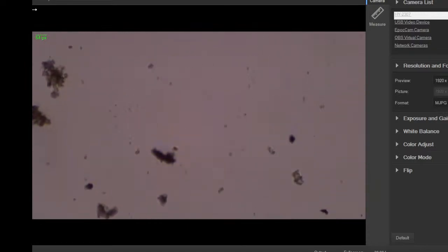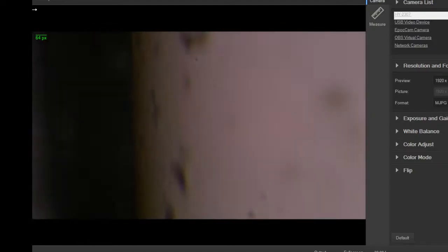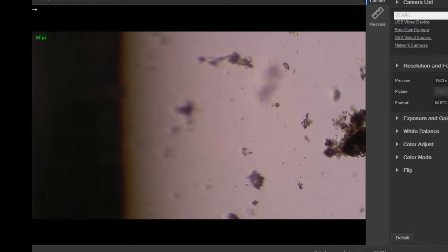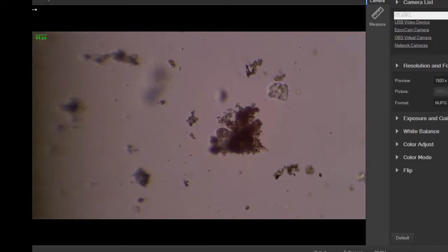Where are you going, guy? Usually when they stay like this, they move for endless amounts of time, back and forth, up and down. So there's a fun trick. I will come back for him since he's not going anywhere off the slide. Oh, there's another one. Yeah, this has some good stuff in it. That was a little bit slower.